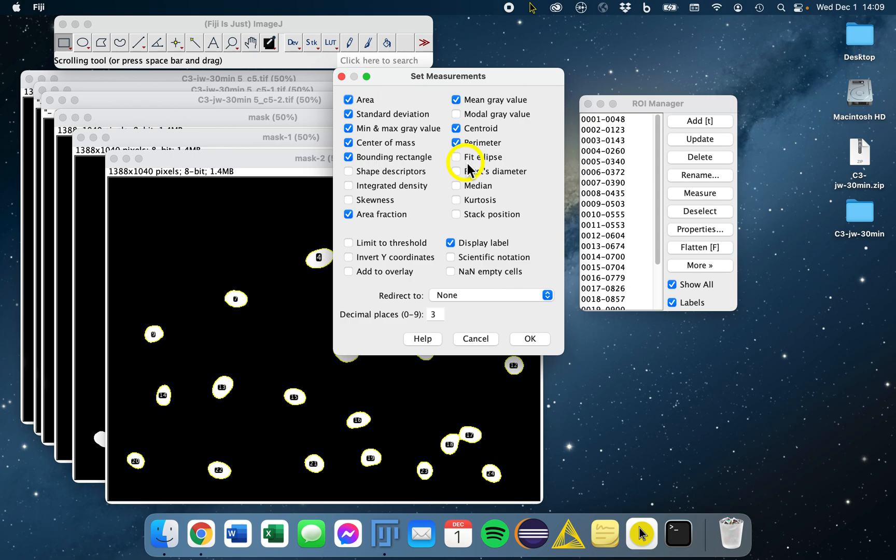You can select and deselect exactly what you want to measure from this list. Let's say we want to focus on the mean gray value, so our average intensity of our nuclei.